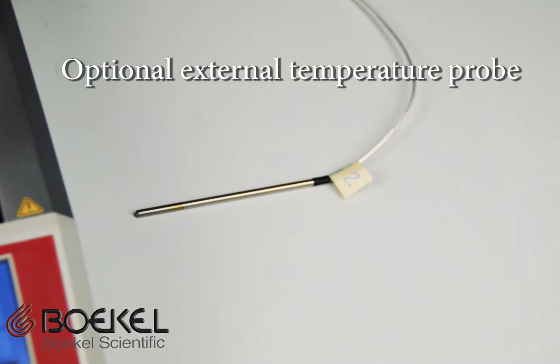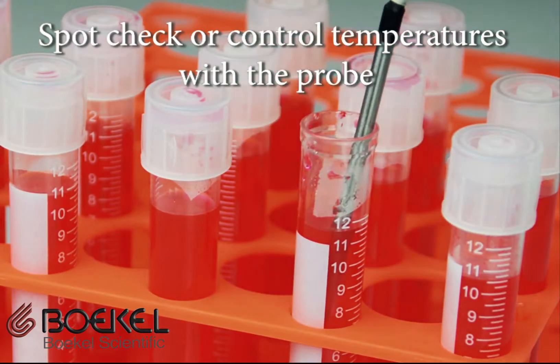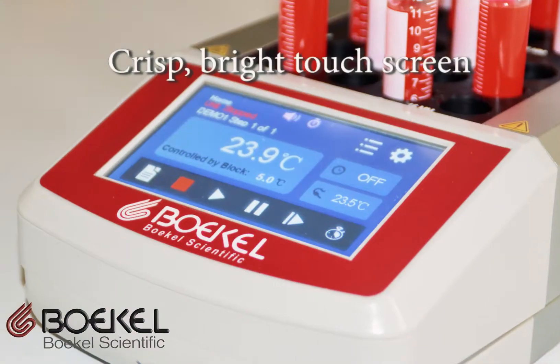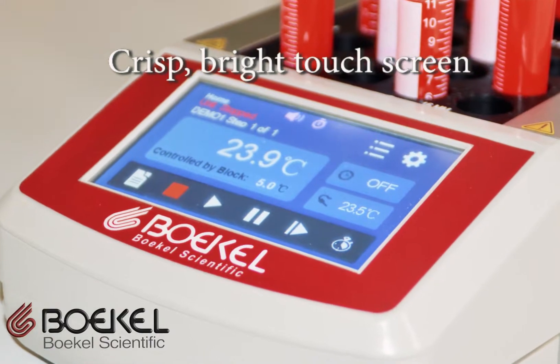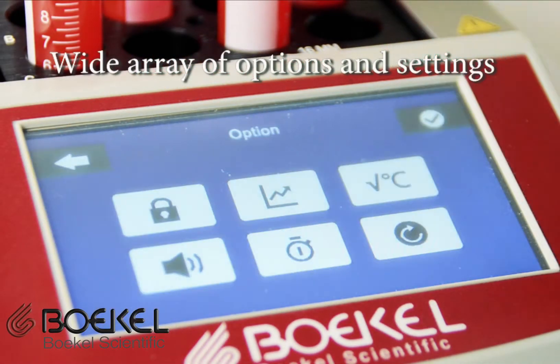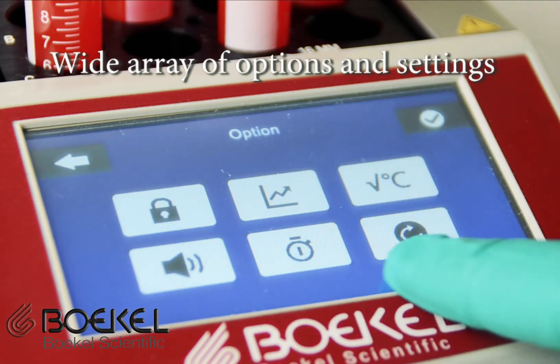Each unit can connect to an optional external temperature probe for spot-checking temperatures or controlling temperature based on the external probe. The touchscreen is crisp, bright, and ergonomically angled. The control system features a wide array of options and settings.